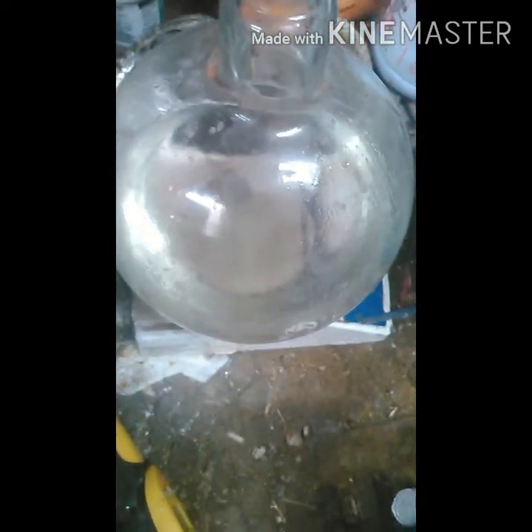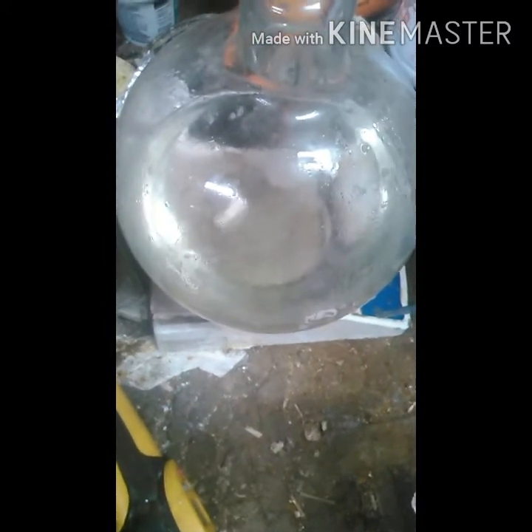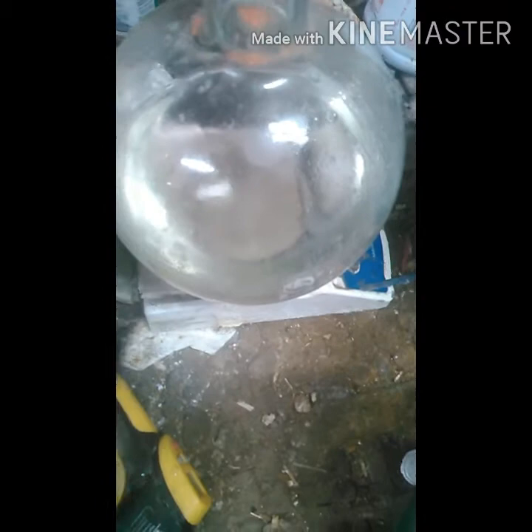What up YouTubers and YouTubats. Today I'm going to be making or extracting lidocaine. I'm basically going to be copying Nile Red's version of extracting lidocaine, but my version of me doing his process. So much like him, I'm using Passion Lube.